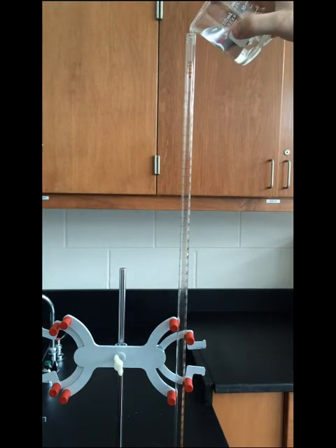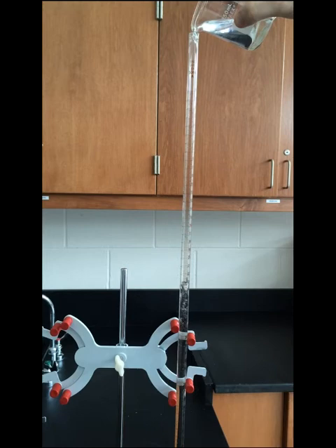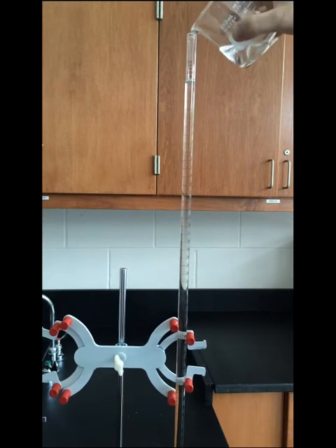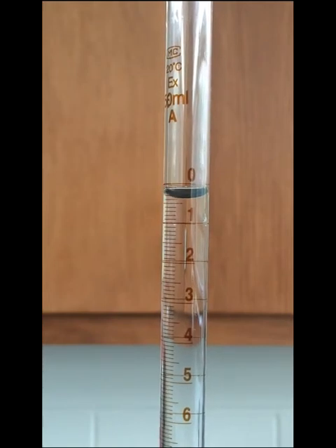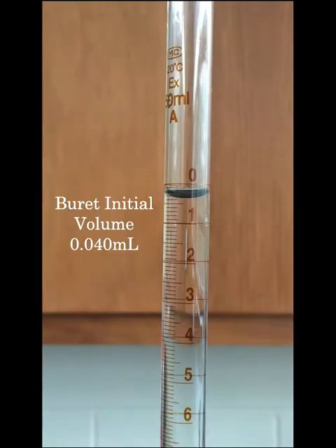We then fill the burette up with the 0.5 molar sodium hydroxide solution. We want this to go beyond the 0.00 mark in the burette because we will drain out a little bit of that afterwards. Because there may be air bubbles in the tip of the burette, we will then drain the sodium hydroxide down to below the 0 mark. This ensures that no air is trapped in the burette. We record down the initial reading volume on the burette.